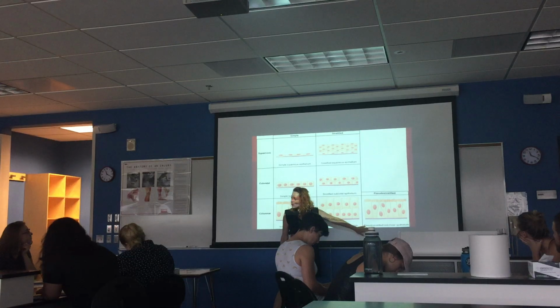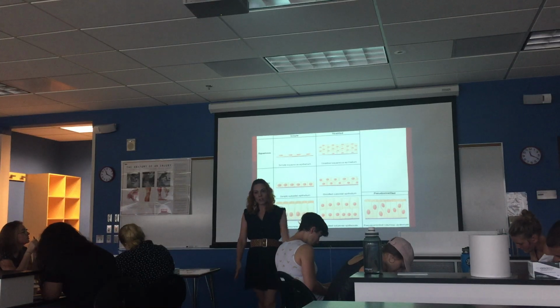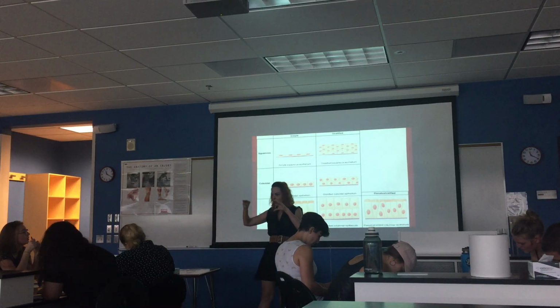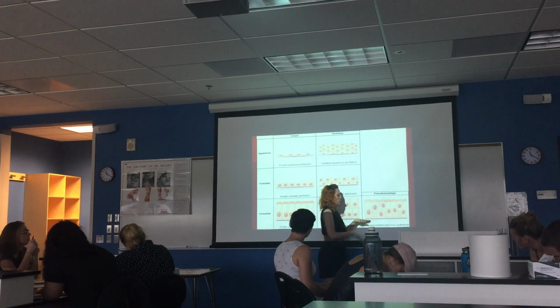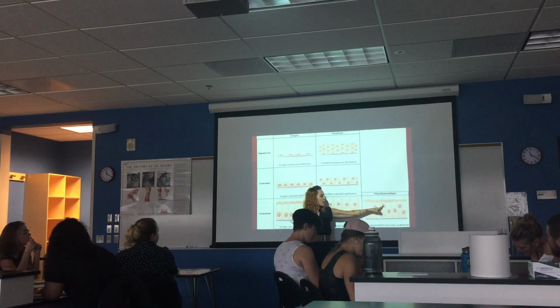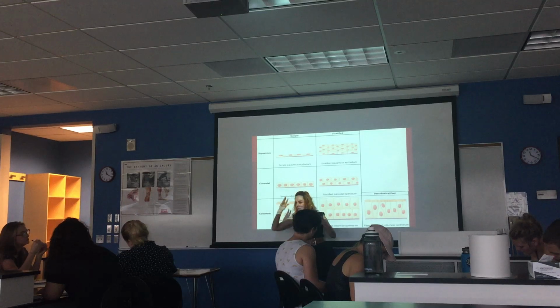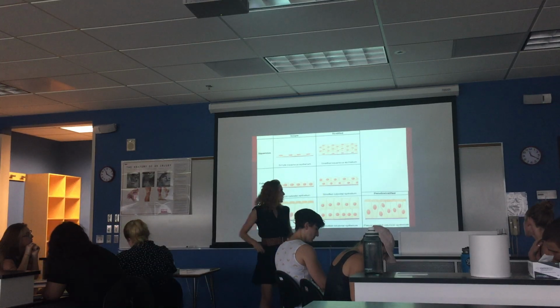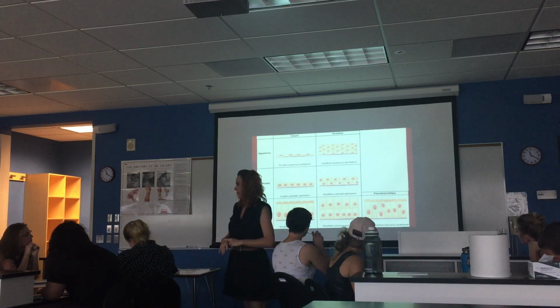This guy over here, pseudostratified columnar epithelial tissue, is a sneaky one. Okay? It's going to give you the impression that there's multiple layers of cells because the nuclei are all over the place. They're not all lined up in a row. But all of the cells are in contact with the bottom layer, the basement membrane down here. Okay, so even though you can't see right here this cell, it actually does go all the way down. So there really only is one cell layer thick. They're just all kind of different shapes. It's the way they orient themselves. So it's called pseudostratified. Typically this one is going to be ciliated as well. So it'll be called ciliated pseudostratified columnar epithelial tissue.